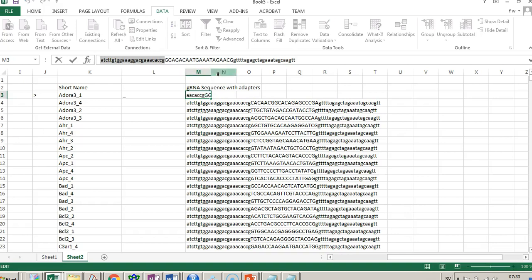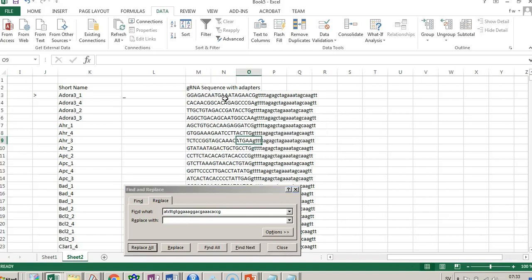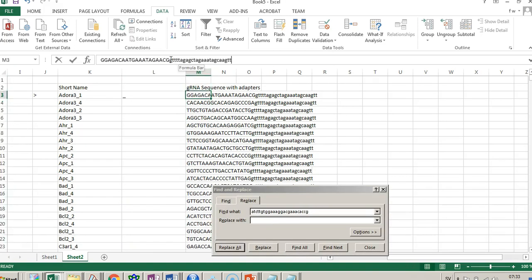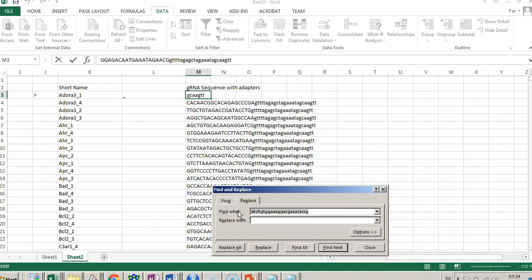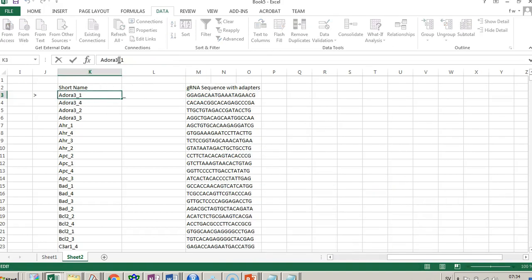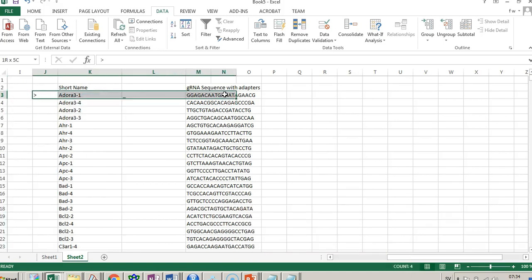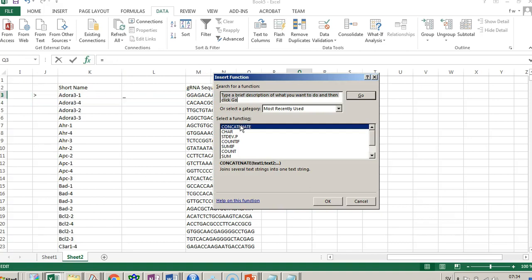I'll start by trimming things a bit — replacing certain characters with nothing to clean up the adapter sequences. Also, the hyphen in the guide name is not compatible with CRISPR Analyzer, so let's replace hyphens with underscores. Now it looks pretty decent, though it's in different columns.